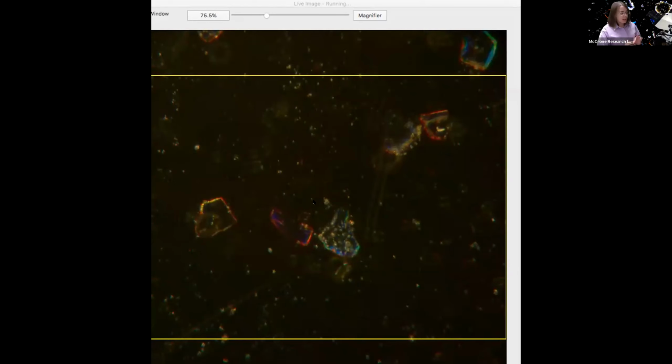So when you're familiar with polarized light microscopy and then you start doing dispersion staining, one thing that people often accidentally superimpose is crossed polars at the same time. And that's not going to work. This is different. With dispersion staining, you have a black background and color around the edges of your particles, but it is absolutely not caused by crossing your polars. So that's an easy thing to accidentally mix up. That's certainly a pitfall I would recommend keeping in the back of your mind so you don't accidentally make a mistake on that one.